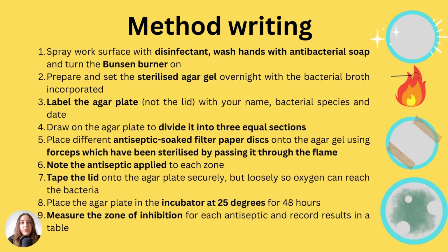The reason also for the tape is just to ensure that the actual lid stays secure, but make sure you don't tape all the way around. That way, you would actually prevent oxygen getting into the agar gel. And if there's no oxygen there, you actually would encourage very harmful pathogenic bacteria to potentially grow, and that would be very dangerous. So you need a little bit of airflow through there.